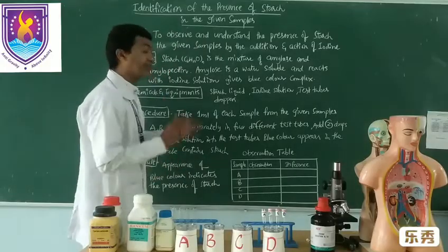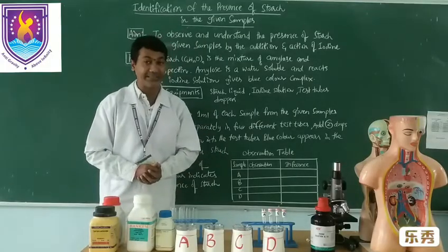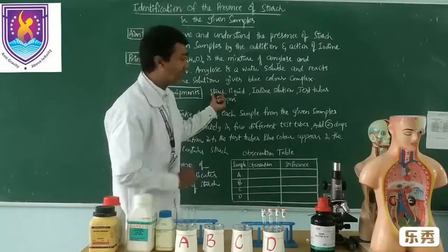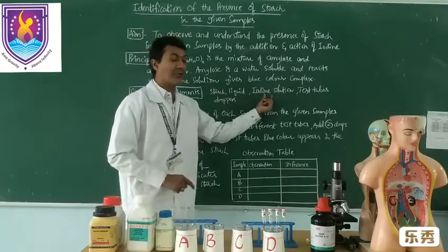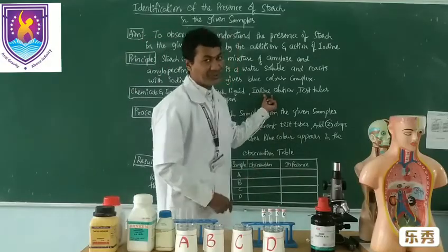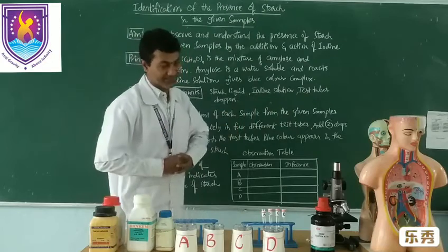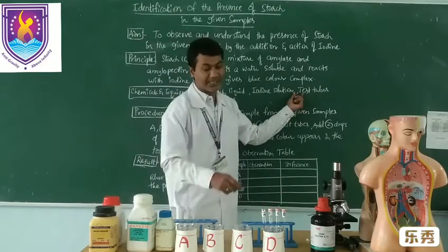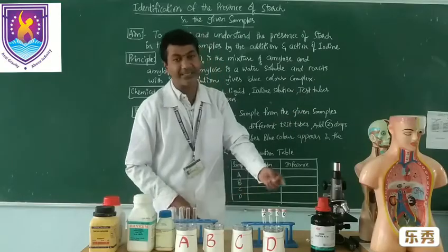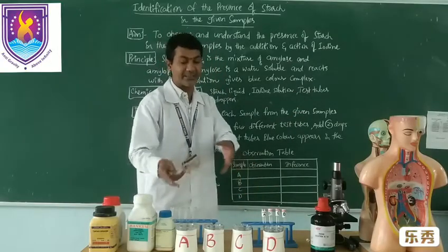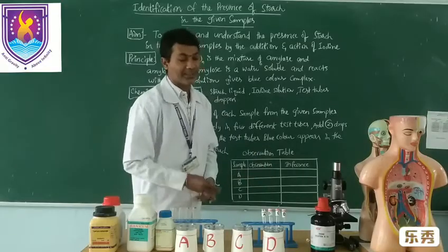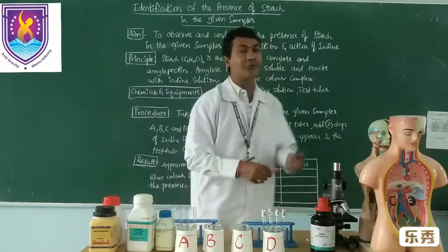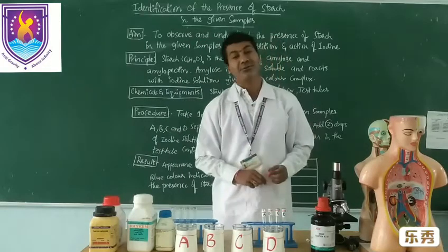Chemicals and equipment: what are the chemicals used in this experiment? Starch liquid — among the four samples, one is starch liquid. And iodine solution, which is used to identify in which sample starch is present. And test tubes — I took four test tubes and named them A, B, C, D to take different samples into their respective test tubes. And droppers — the dropper helps to drop the iodine into the test tubes.